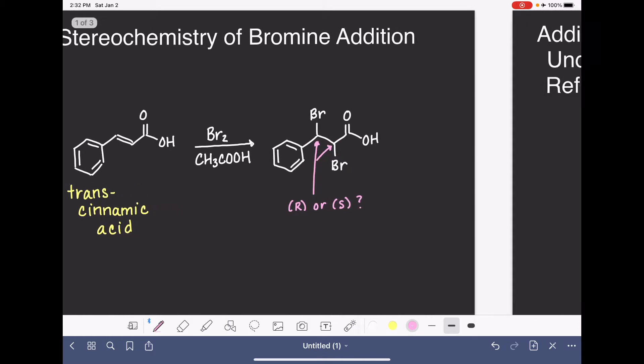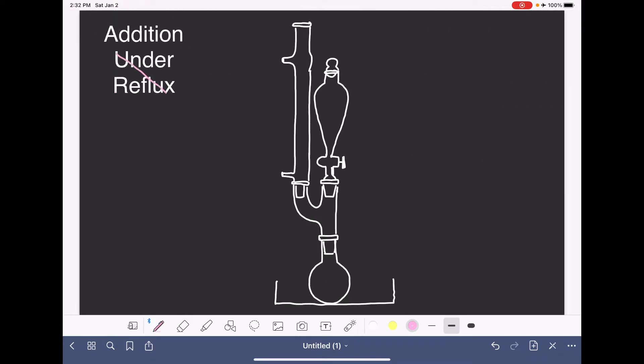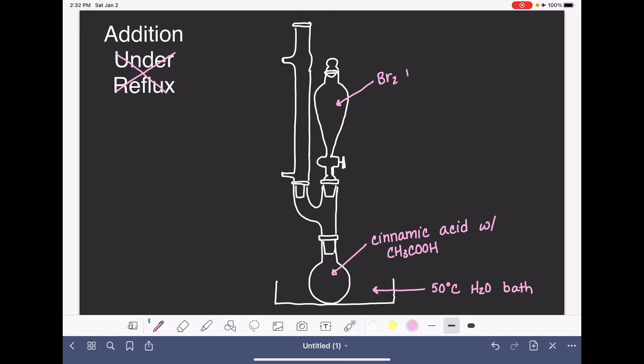To perform this reaction, we're going to be using the addition under reflux apparatus, although we will not actually be performing this reaction under reflux. We will be keeping our round bottom flask in a warm water bath at 50 degrees Celsius. The reagents are simple: trans-cinnamic acid in the round bottom flask, a little acetic acid as solvent, and bromine dissolved in acetic acid added via a separatory funnel. Pure bromine, Br2, is really dangerous, so dissolving it in acetic acid makes it safer to work with. With the water condenser, water should enter the bottom port and exit the top port.